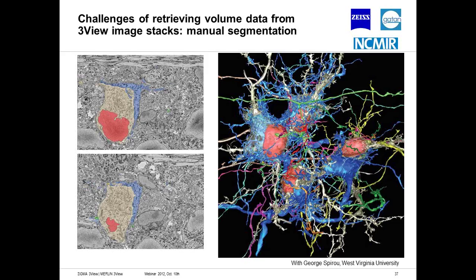Not surprisingly, really, to me, you can learn quite a bit just by looking at the image stacks without doing any segmentation or sophisticated image processing. As Joel said, instead of one person sitting in a darkroom in front of an electron microscope looking at a few sections, you sit at your computer or in a group in front of a monitor and browse through hundreds or thousands of wide-field image planes in 3D. It's like exploring your sample with Google Earth. And once you try it, you'll wonder why you ever did it the old-fashioned way. I think it really will change the way we not only acquire EM data, but the way we view EM data.